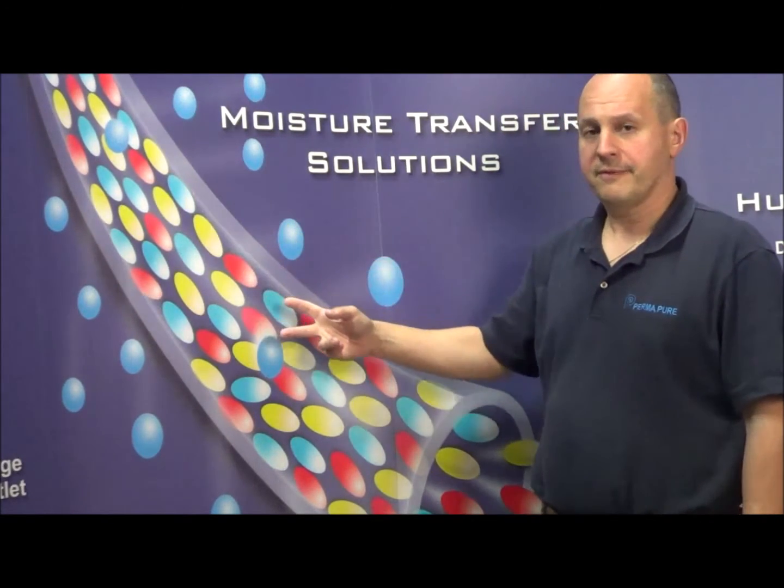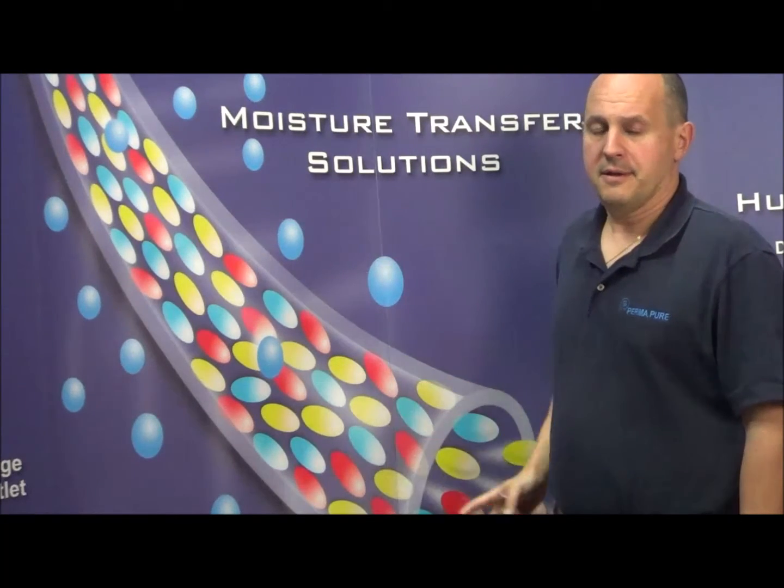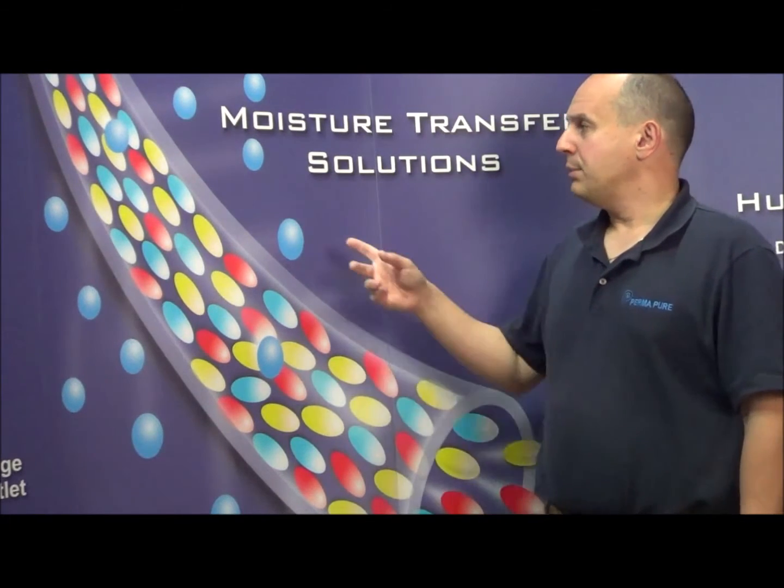In this image here, you can see the colored jelly beans demonstrate the gas sample flowing through the tubing, and the blue spheres represent the moisture being removed from the gas sample.